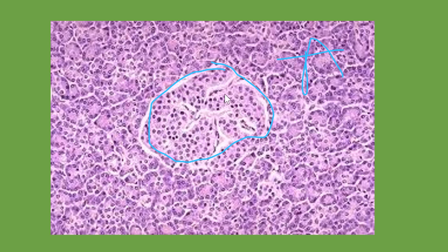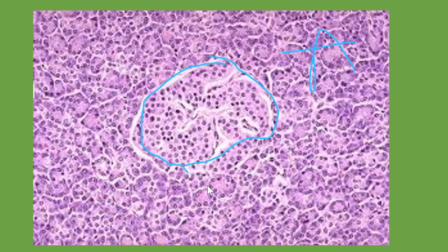That kind of helps too, because you can see these cells clearly go a different way than these. Well, this actually is a part of that isle here. But you see how this is a differentiation from right here, right? I don't know if that helps you at all, but there it is.